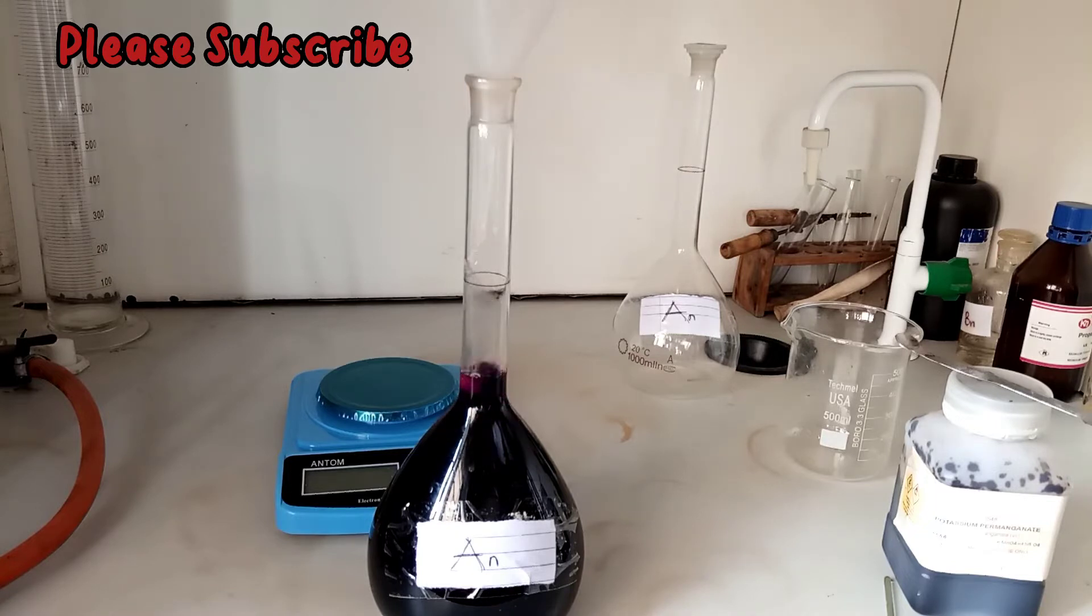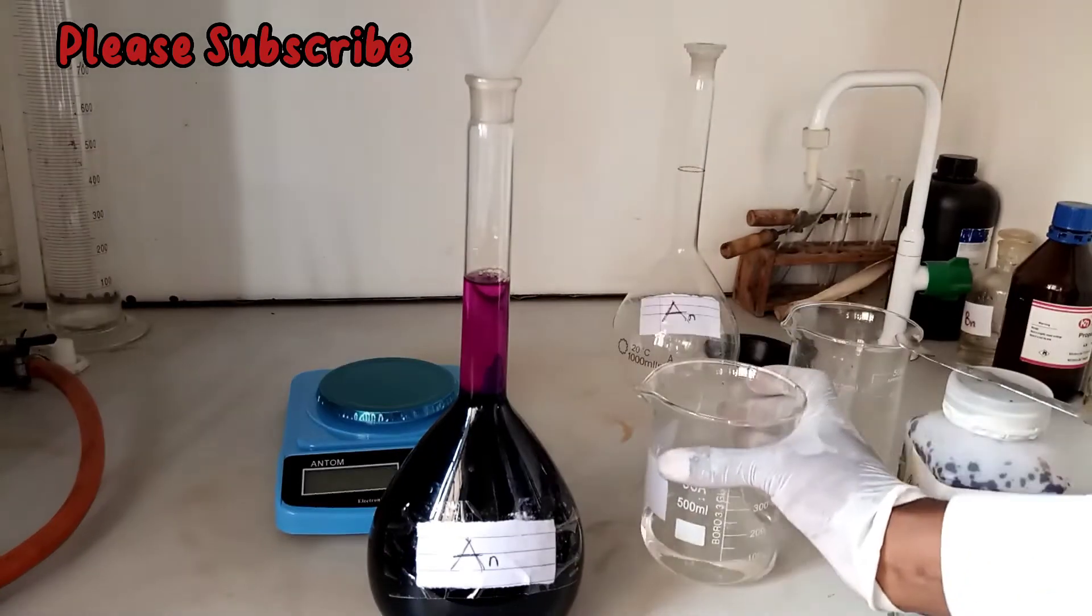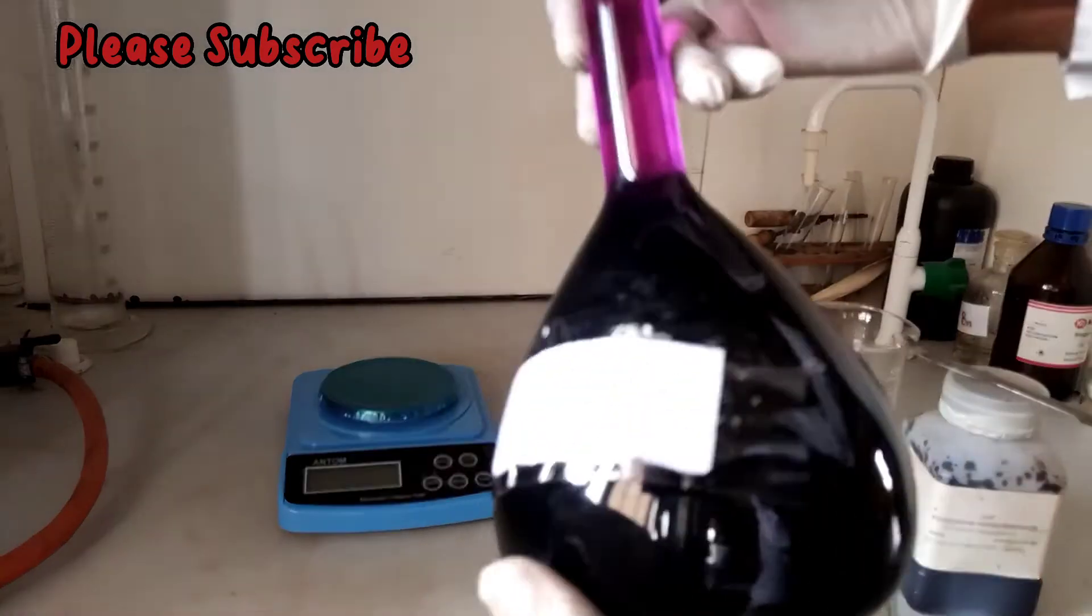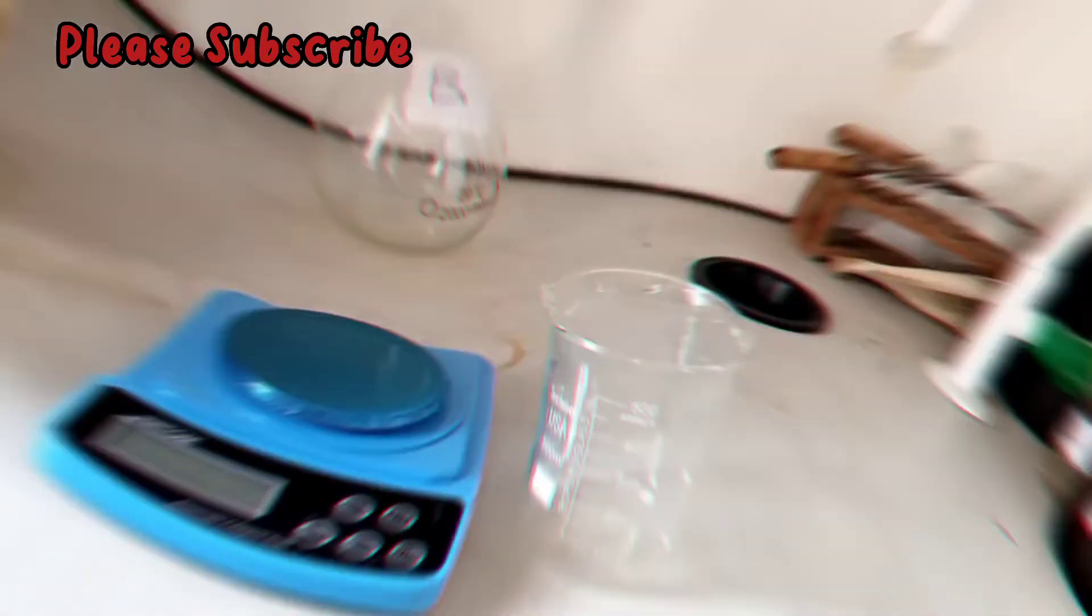Ensure you take readings at the meniscus. So this is our 0.02 mole of potassium permanganate per dm³. This is how you prepare it.